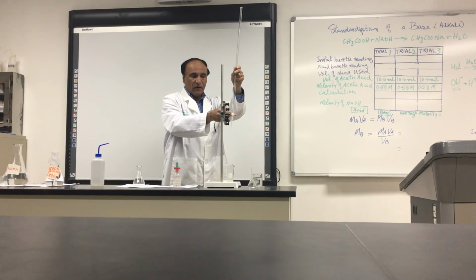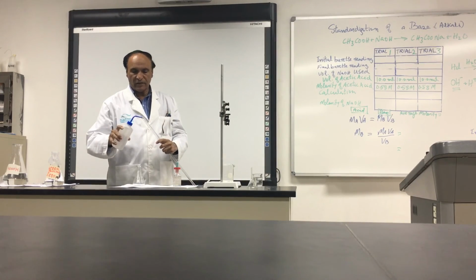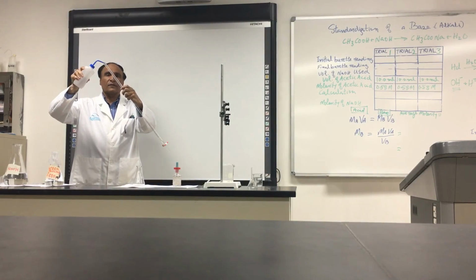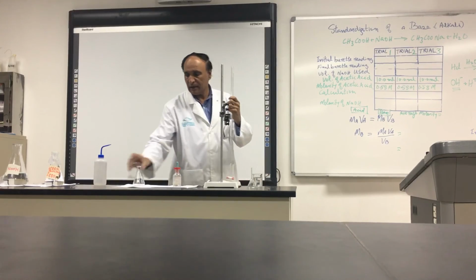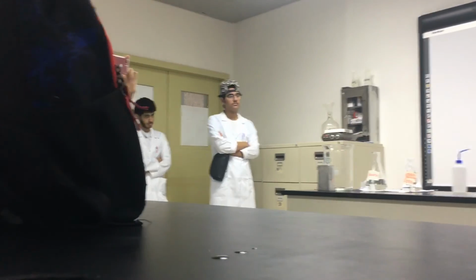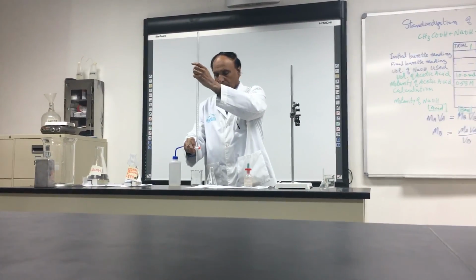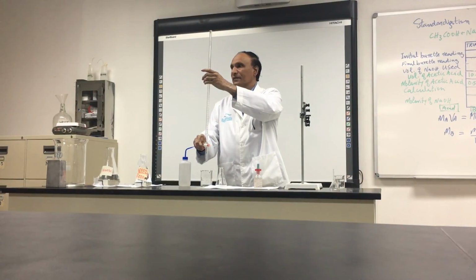When you go home, you will open it. And now you close it, you want to start the experiment, and add into it some distilled water. Do you see what I am doing? You can throw it in a beaker, or you can throw it directly over here. You see that this is now washed with distilled water.